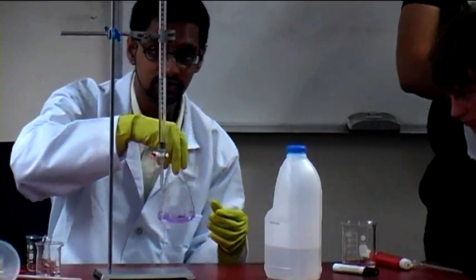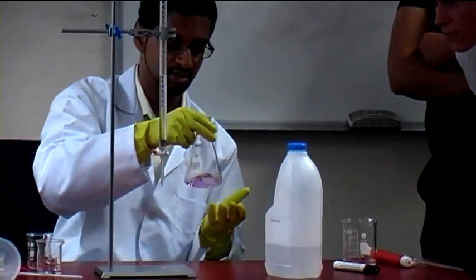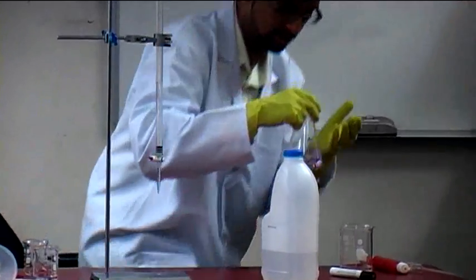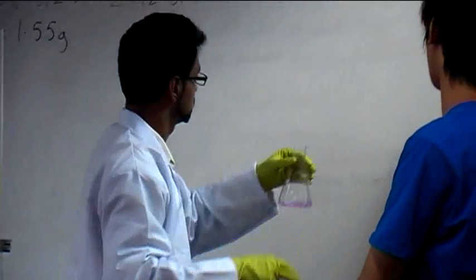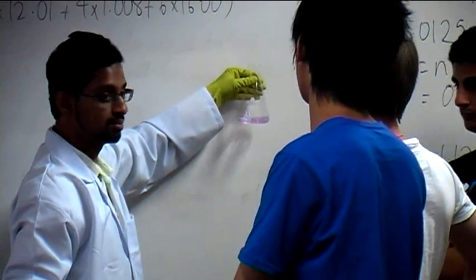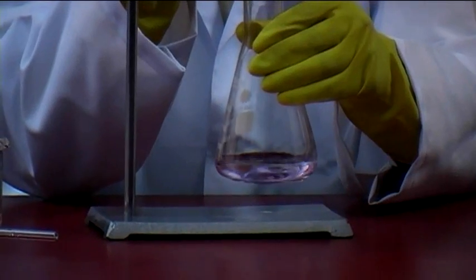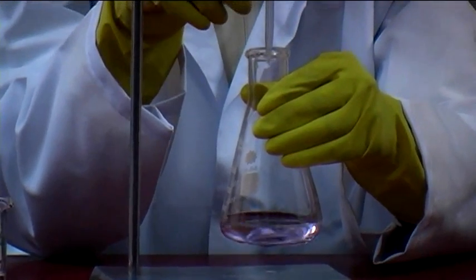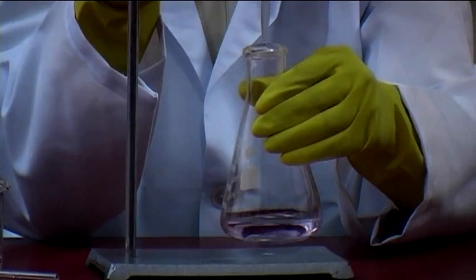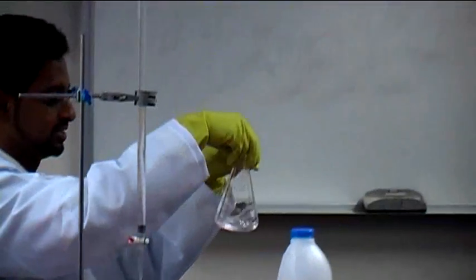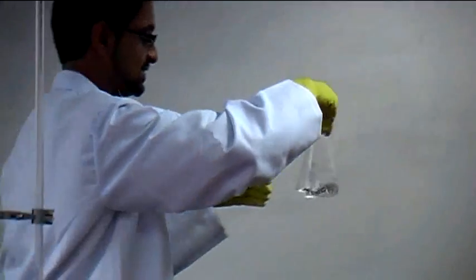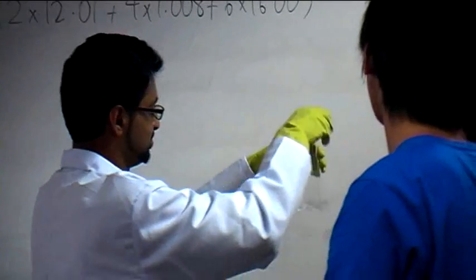We're up to 43.2. We're expecting 0.3 more mL. Let's have a look. Much, much fainter pink now. Let's see. That dodgy of four. Wow. Perfectly clear.